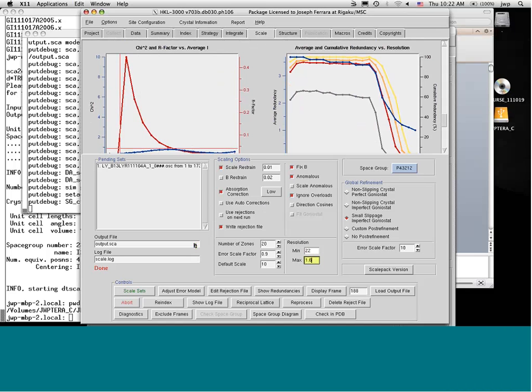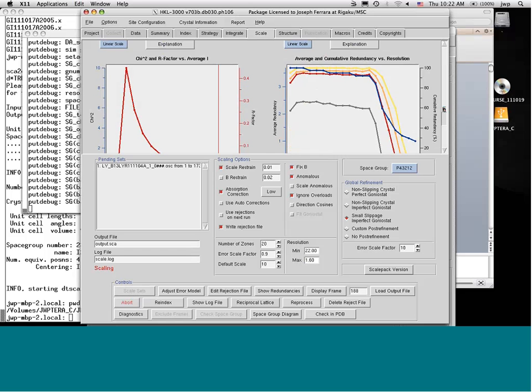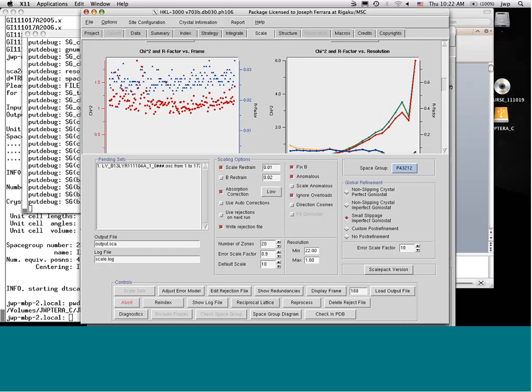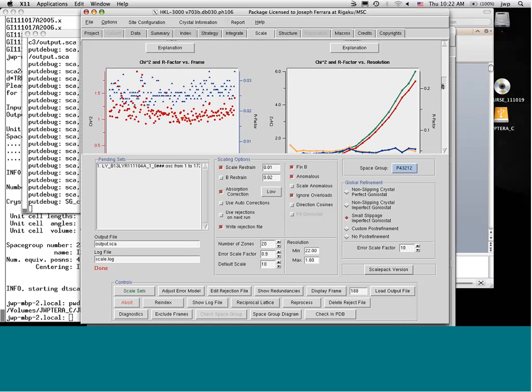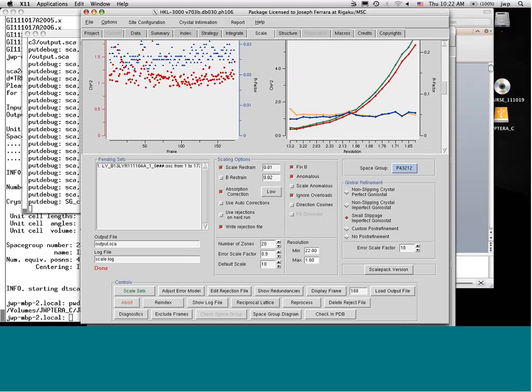So to review, I came in with the data. I set absorption correction, anomalous, small slippage. I pressed the button. Then I looked at the results, and now I'm trying to get the estimated standard uncertainties, or the sigmas, more or less correct, so that the spread from the R merge matches the standard deviations estimated from integration from the Poisson counting statistics.